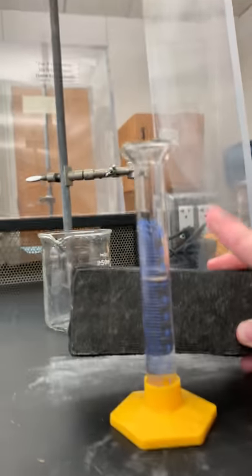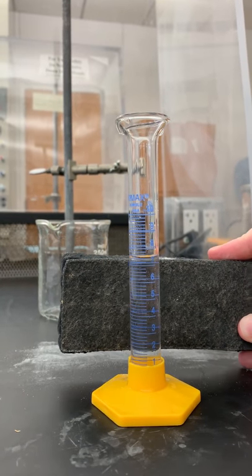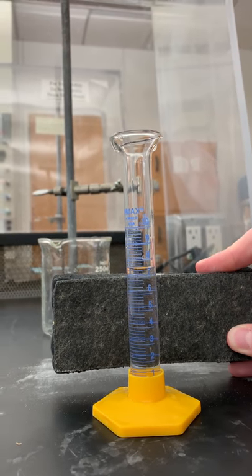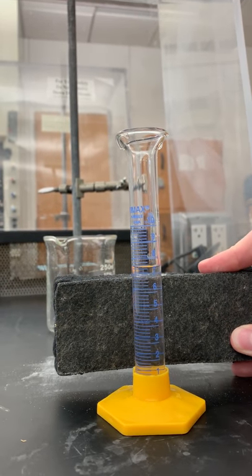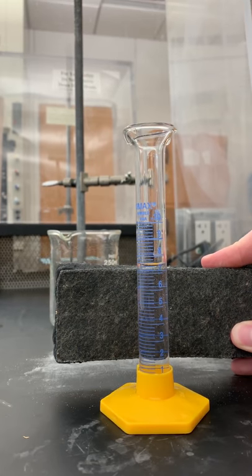There are ten whole number markings on the cylinder and they are milliliters. In between each of the whole number markings there are four of the smaller ones, which represent 0.2 milliliters.